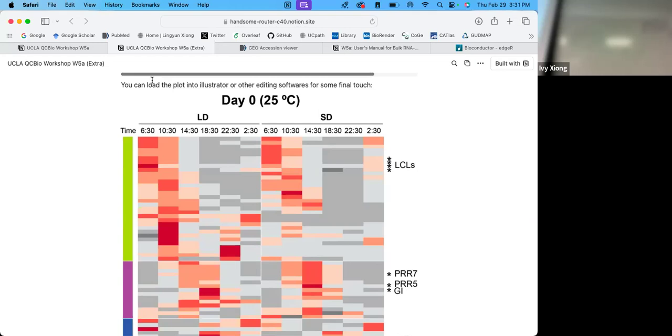So for your own data set, you can just use the script as a template. Yeah. But you wrote your own script. Yeah, but that's not trivial. None of it is trivial. Yeah, but when you're working with it every day, then you want to do it in one go. So you can run R scripts on the terminal. I thought you have to run it in R. Why couldn't I have done it on R Studio?